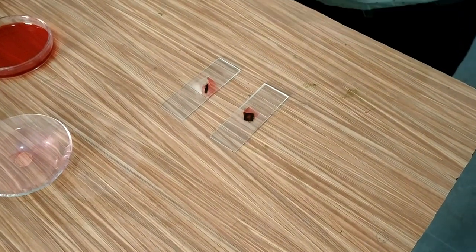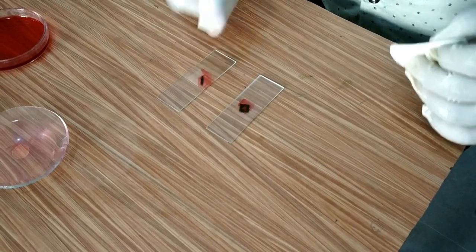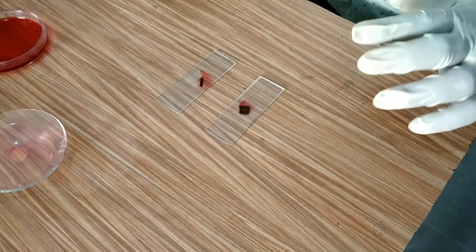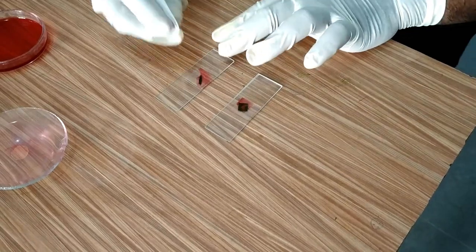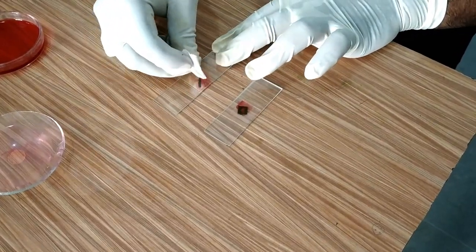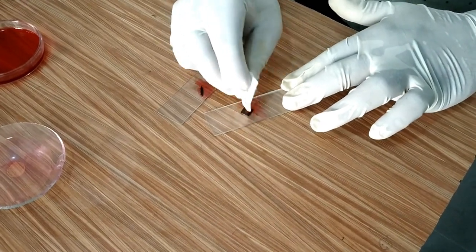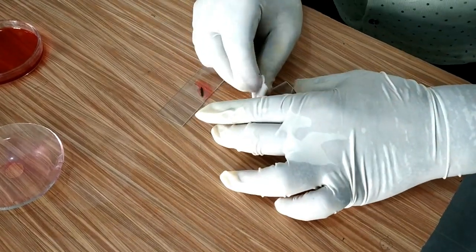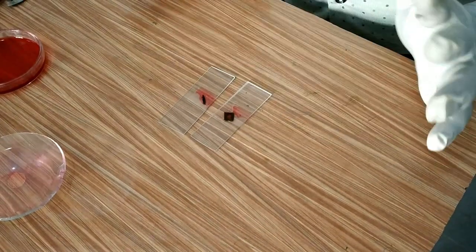After placing the cover slip, if there is excess stain coming out from the edges of the cover slip, then I will use absorbent paper to soak the excess stain. So now your slide is ready for further observation.